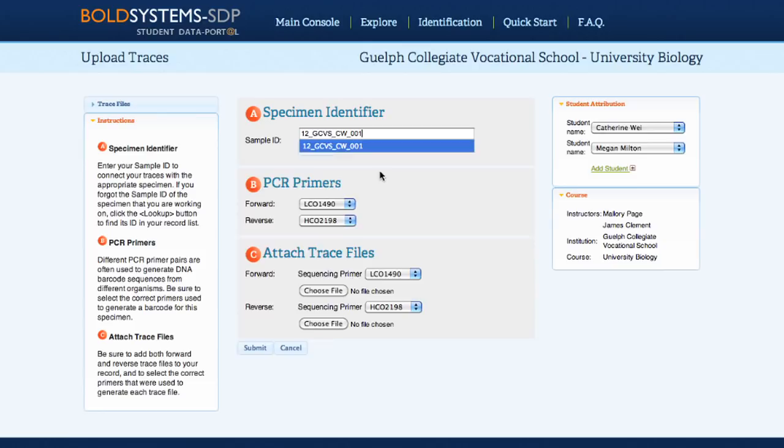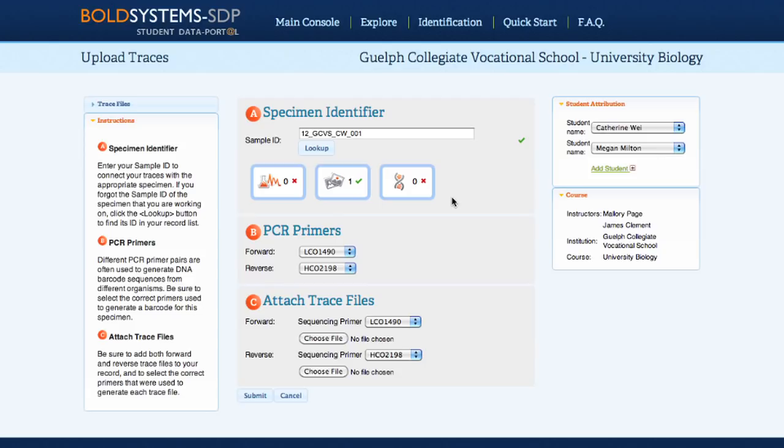Once the sample ID has been filled in, a record progress report will appear, showing the number of trace files, images, and sequences that have already been uploaded to a record. This allows students to monitor their own progress.